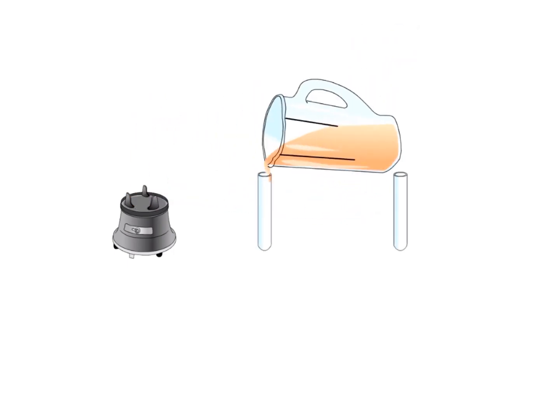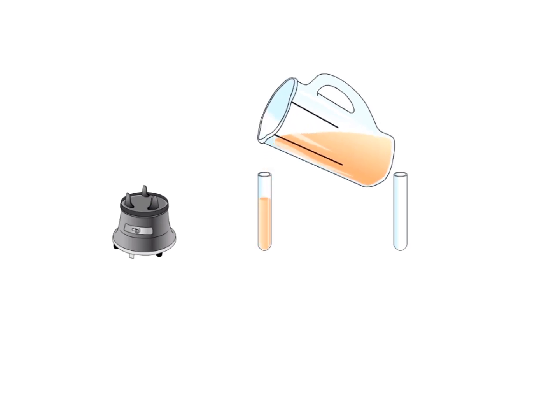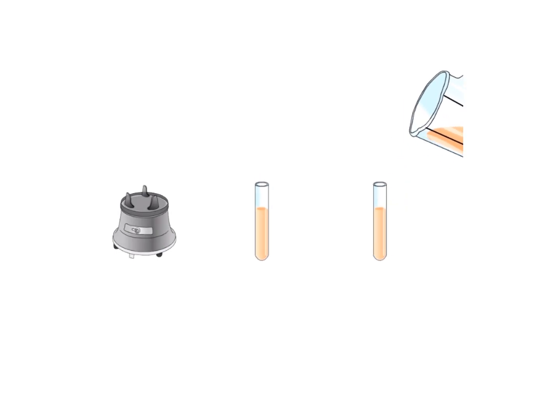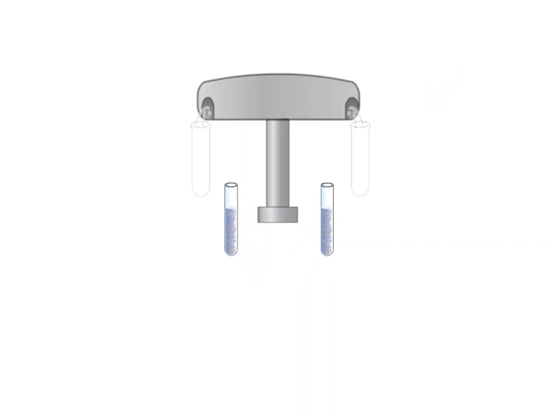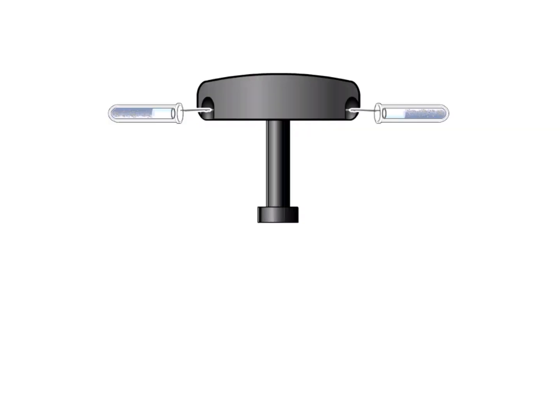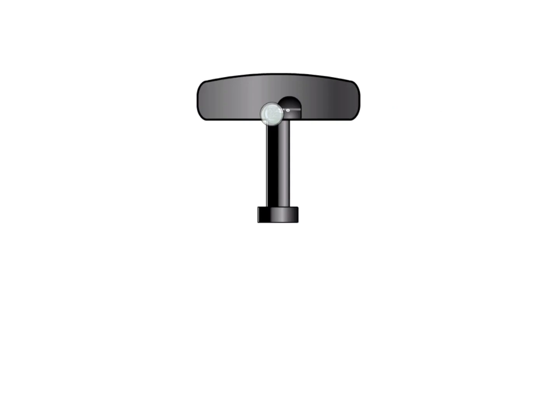The suspension of broken cells is called the homogenate or lysate and is now separated into its components by a series of centrifugations. An ultracentrifuge can rotate samples at very high speed, over 100,000 rpm, to produce forces up to 500,000 times greater than gravity. However, the first spin is usually set at low rotation speed, producing a centrifugal force of about 800 times the force of gravity for 10 minutes.